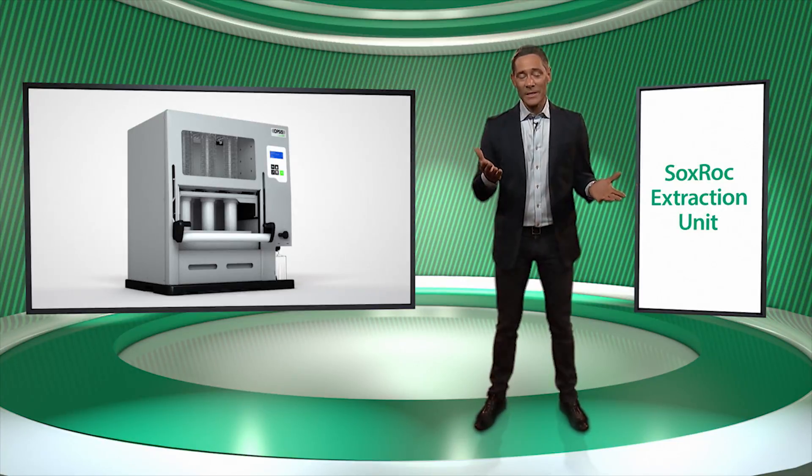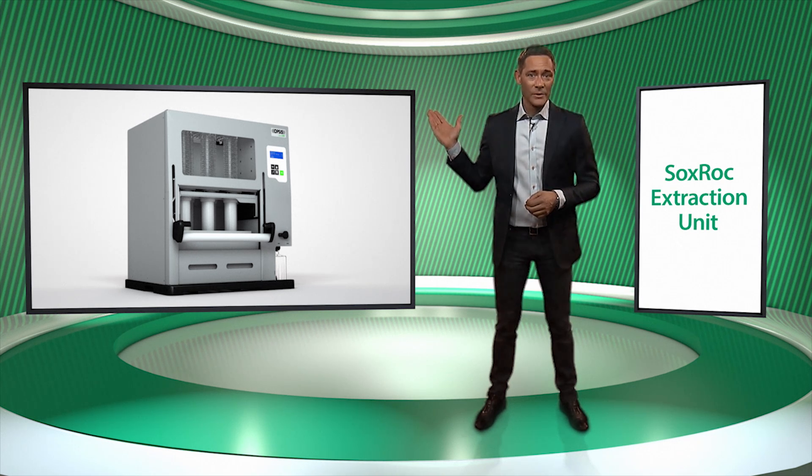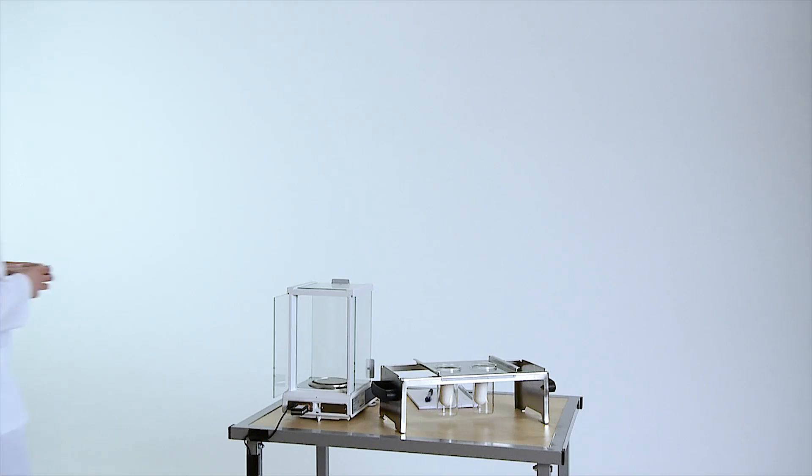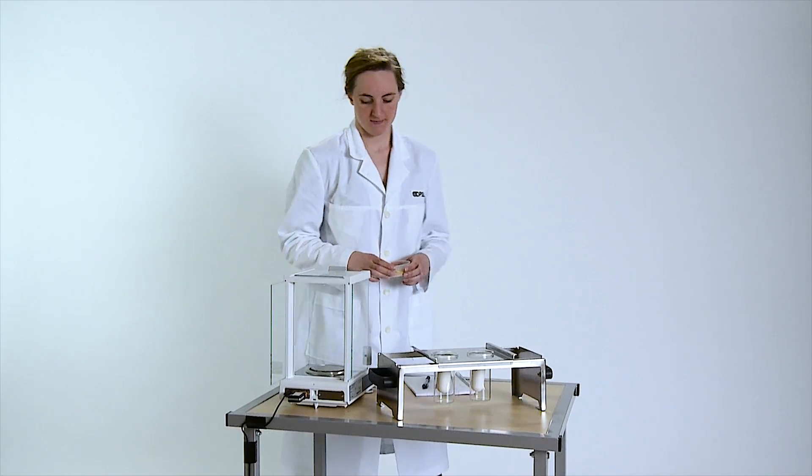As you can see, the Soxrock Extraction Unit is an instrument designed with safety in focus. We will now show you how efficient and easy you can work with it. You start by weighing the samples.